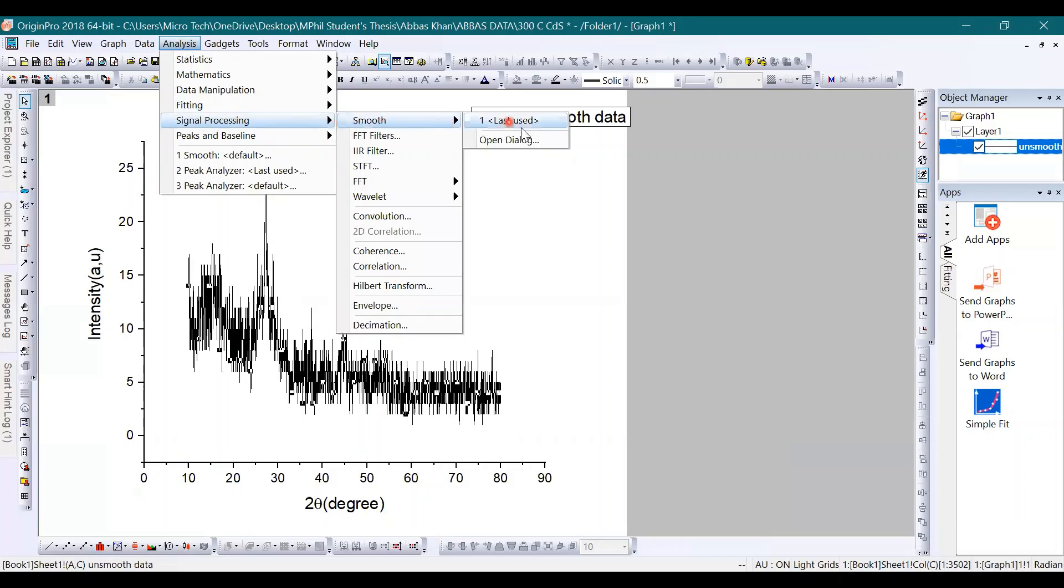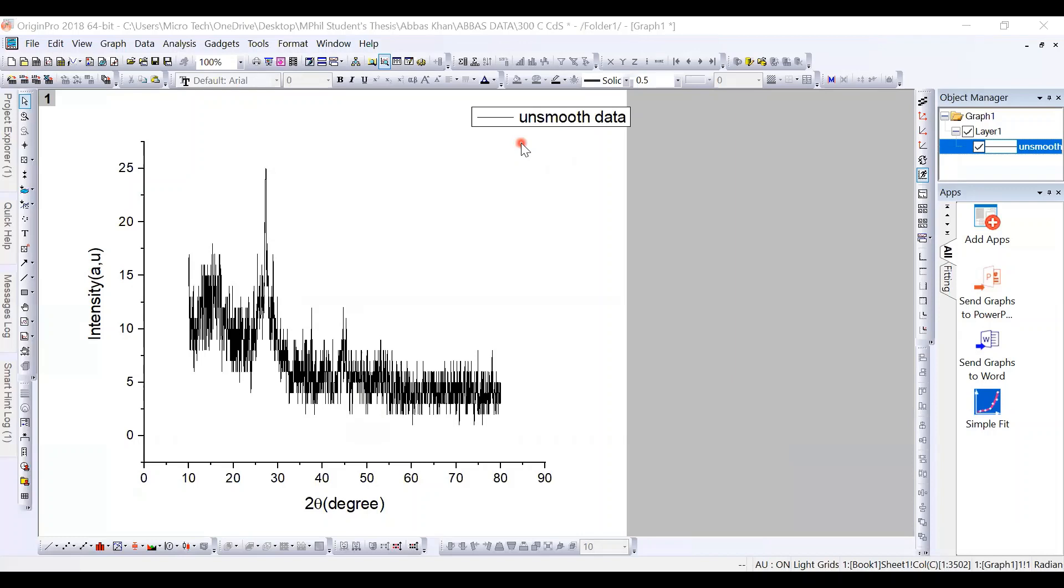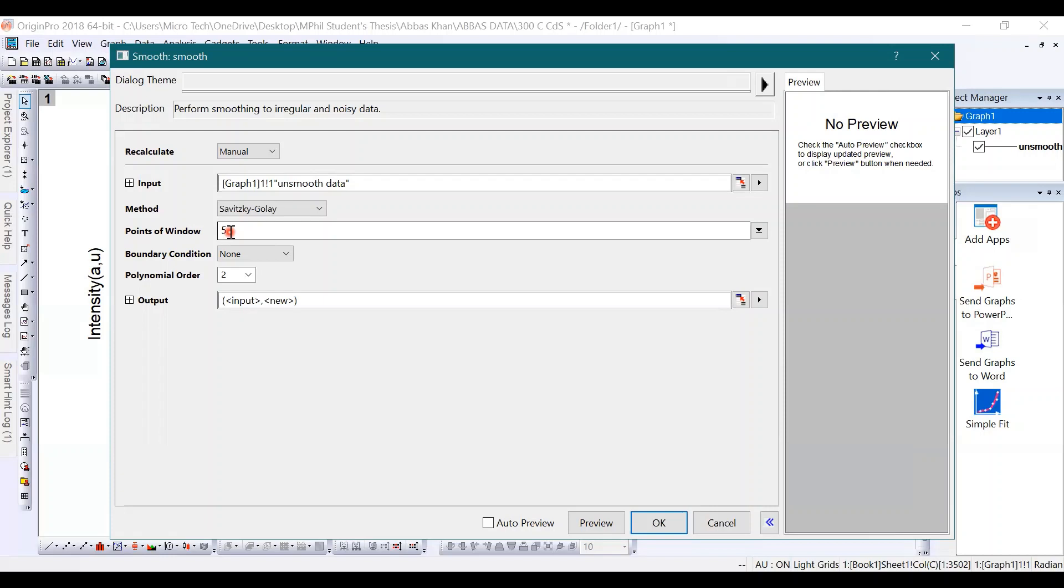Once you do that, this window will be opened. Focus on this number which is 5 already written, but 5 is a small number for smoothing your data. So replace 5 by 50. Once you wrote 50, then click on OK.